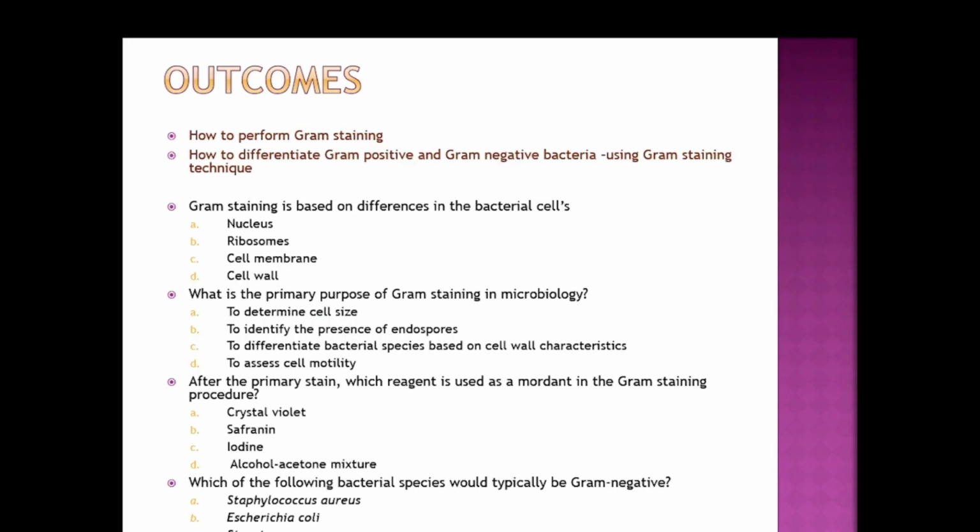So by the end of this presentation, you should be able to perform gram staining yourself and differentiate between gram positive and gram negative bacteria using this technique. Now you know how to perform the gram staining and how to differentiate gram positive and gram negative bacteria using the gram staining technique.